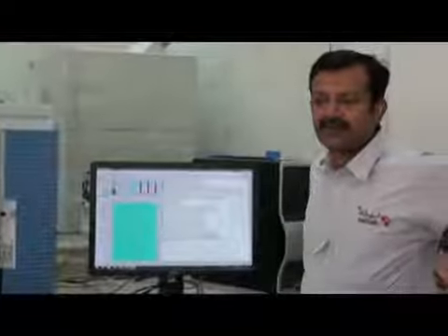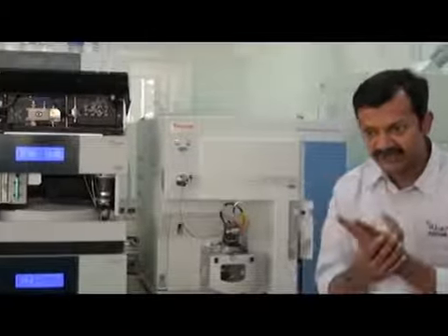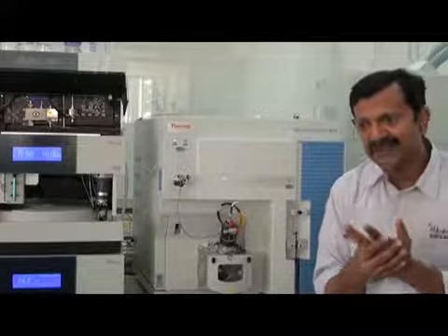Why do it with B and D? Is A not enough? No. It depends. I am using in my analysis line A and line B. And line D I will use for washing. So I have 3 lines in my use. So I have to do purging for all 3 lines.